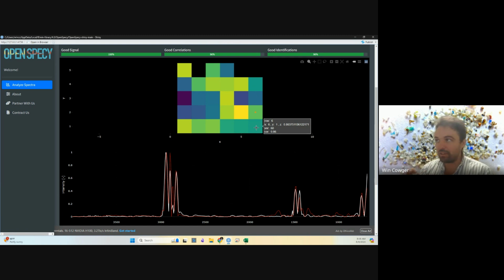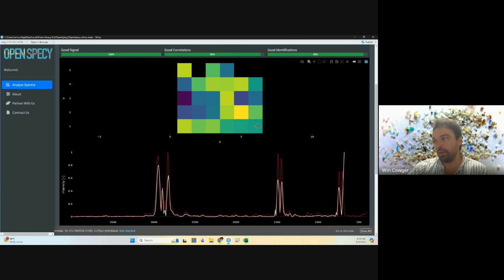How does it get analyzed? Play around with some of the pre-processing settings on the tool so that you can really gain an intuition about how to analyze this information. And then you'll be ready to set your rules that make sense for your spectra and your pre-processing routines that make sense for your spectra. And then once you have that, it should be a lot faster.